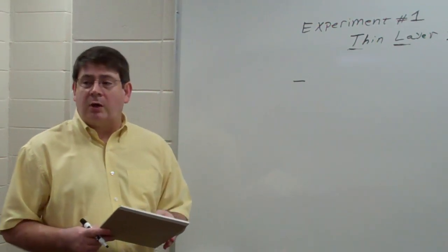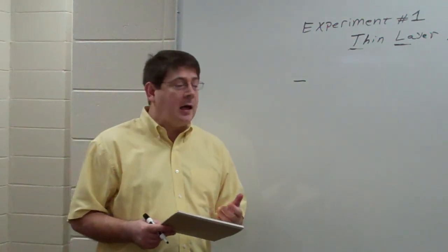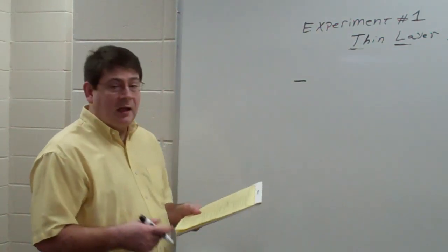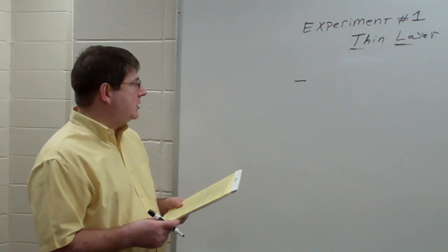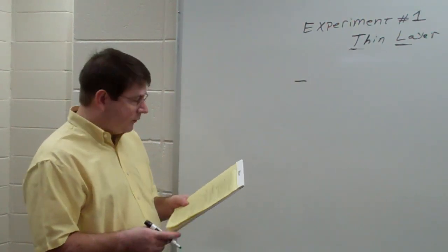And it's very important that you understand thin layer chromatography simply because you're going to be using it a lot as the semester goes on, as well as next semester in 256. So it's very important that we understand the basic concepts of thin layer chromatography.